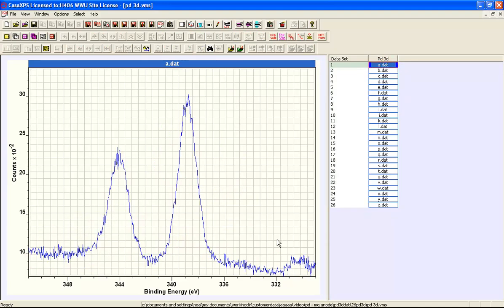And they produce photoemission with an offset and a reduced signal relative to the primary photoelectron process.